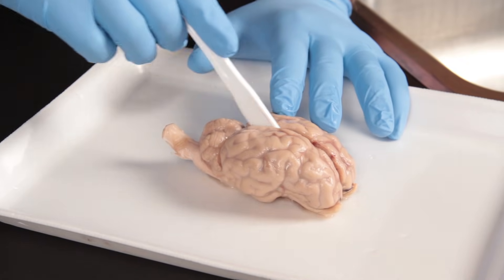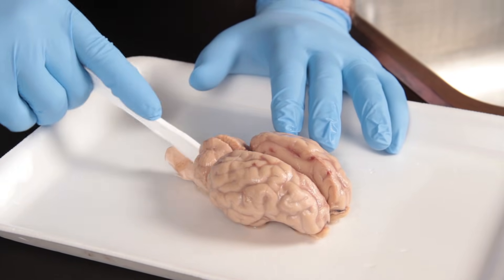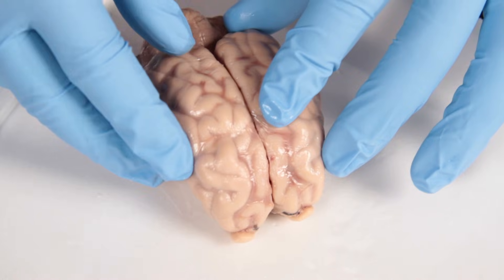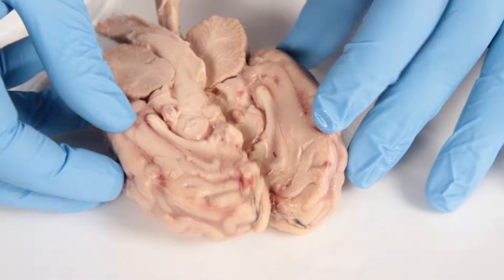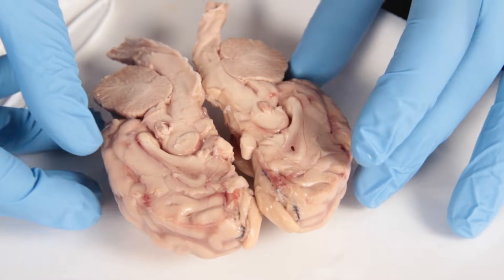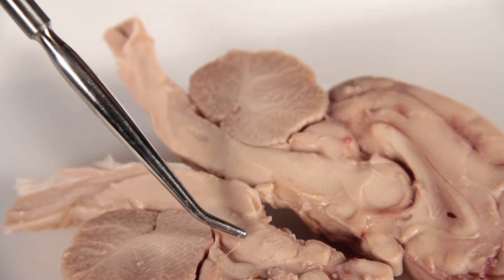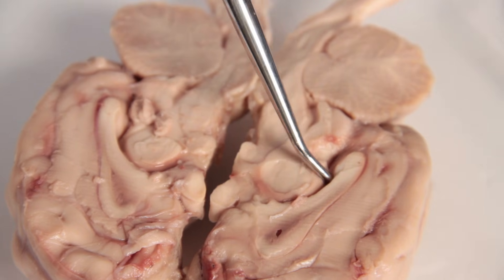Bisect the brain along the medial longitudinal fissure. Once bisected, observe the internal anatomy of the brain and identify the following structures: arbor vitae, brain stem, and ventricles.